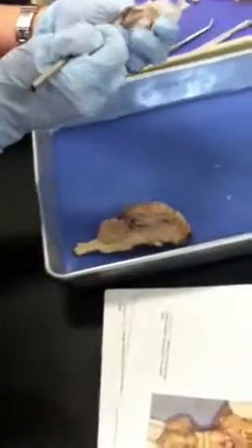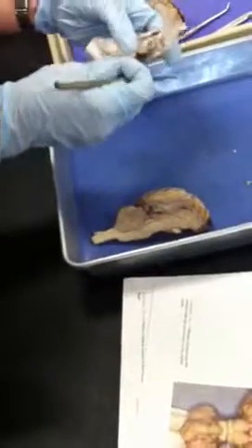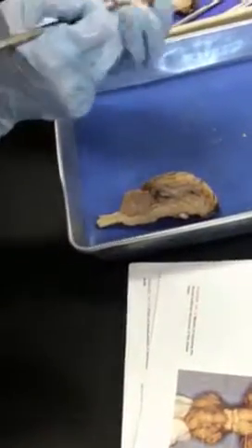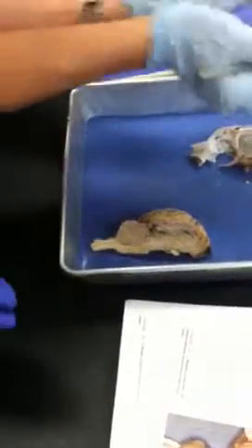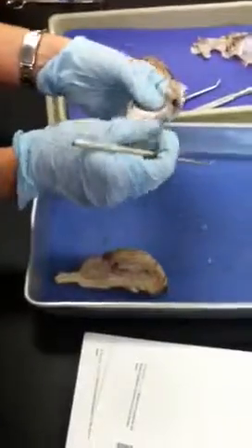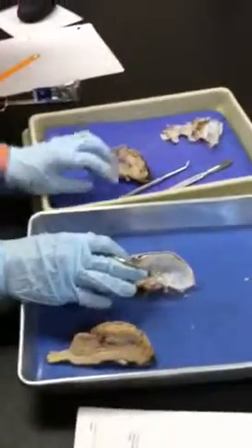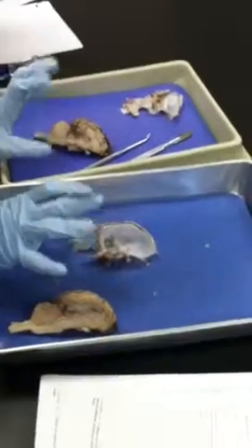So its pituitary gland is pretty big in comparison to our brain, right? It is a little bit bigger. This is the optic nerve and tract that came off too. It kind of just peeled right off, like a banana. You have to be careful with that if you want it intact. It's a lot easier to take it off than it is to keep it. It's a little bigger in sheep. The other thing is relative to their body size, it's not that much bigger than ours, a little bit.